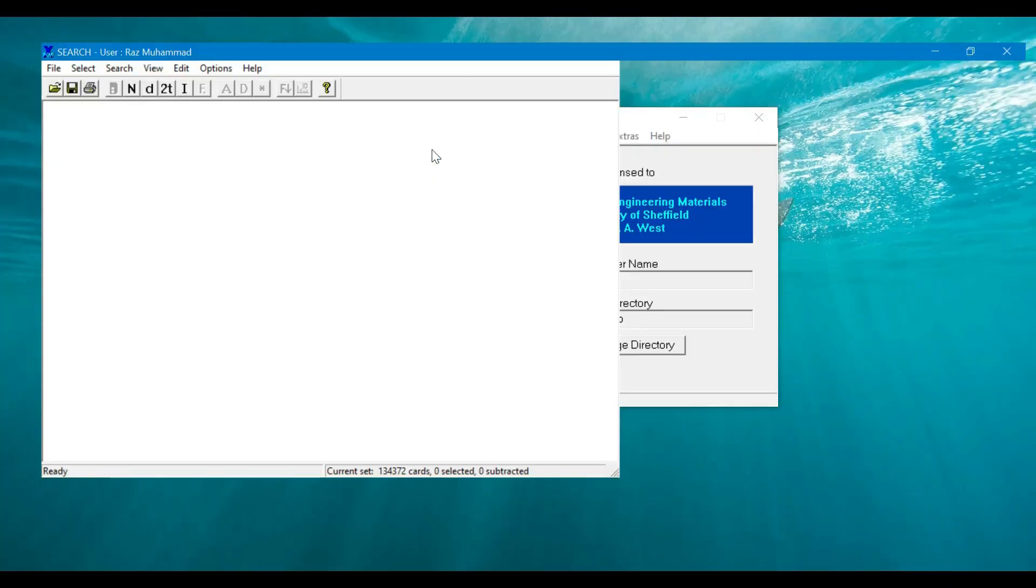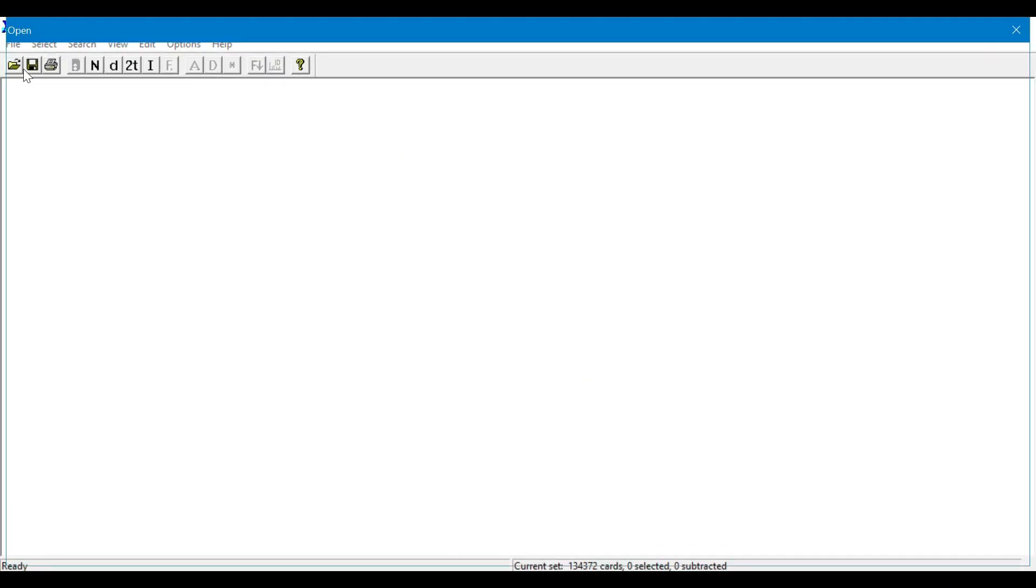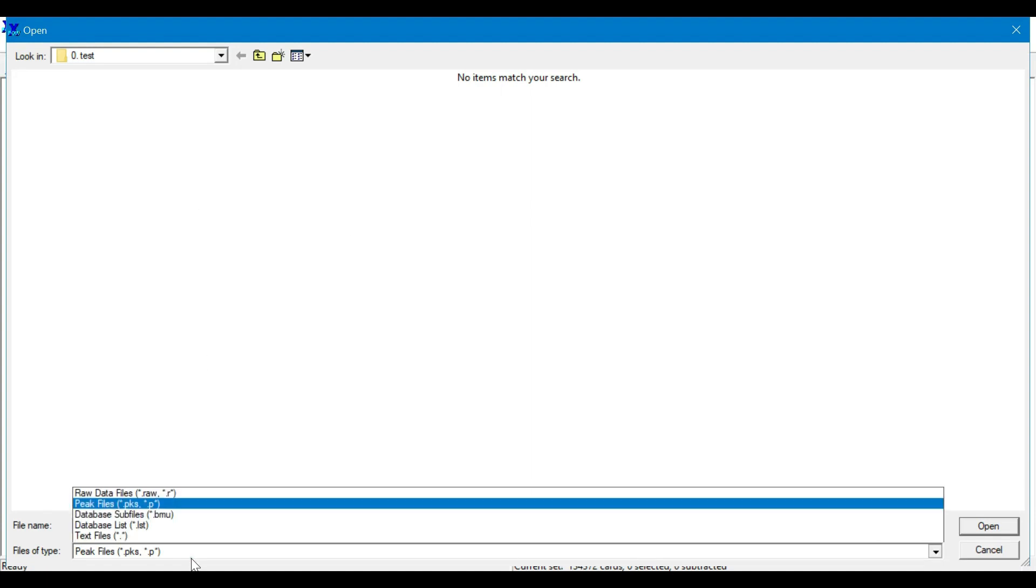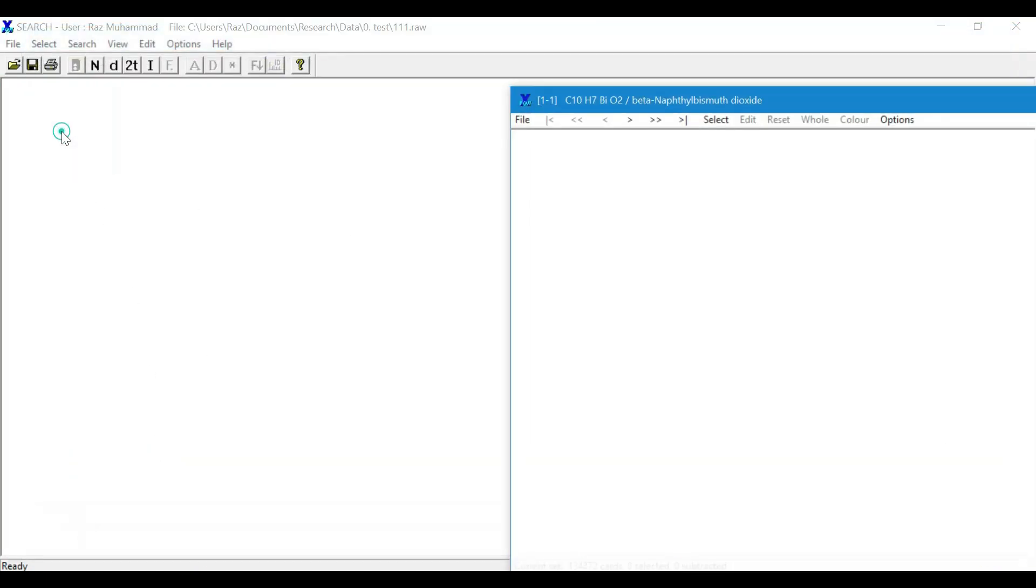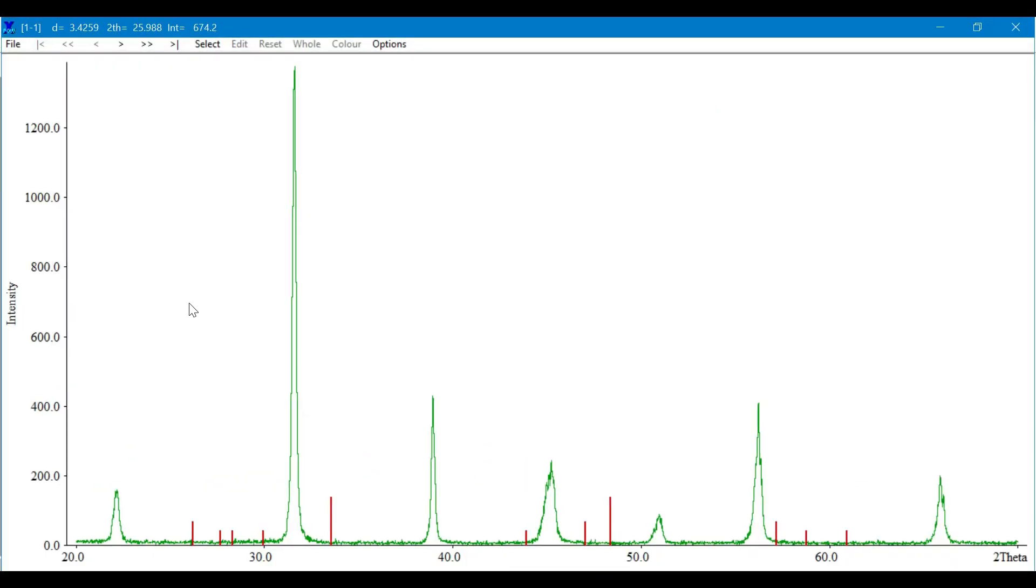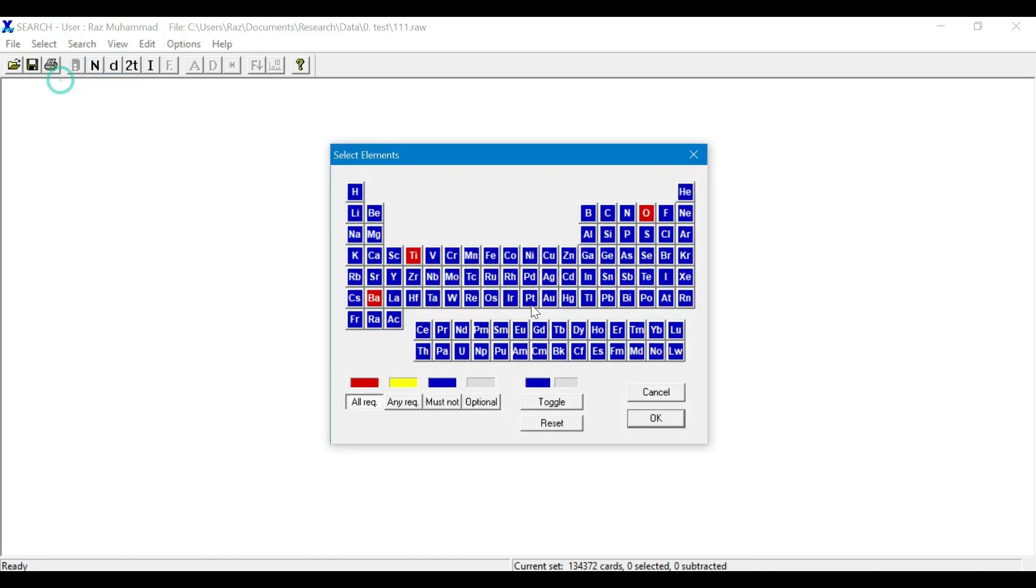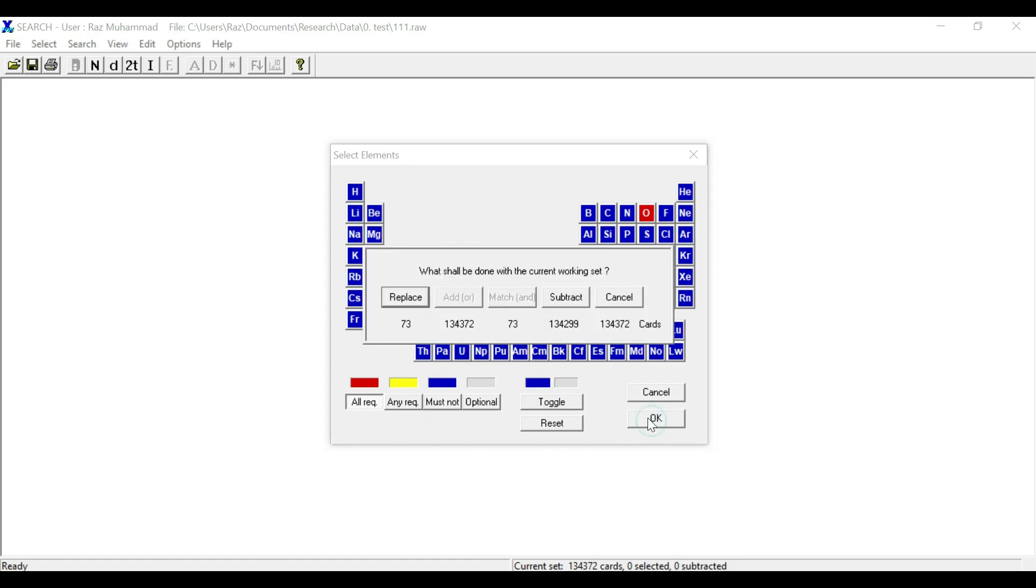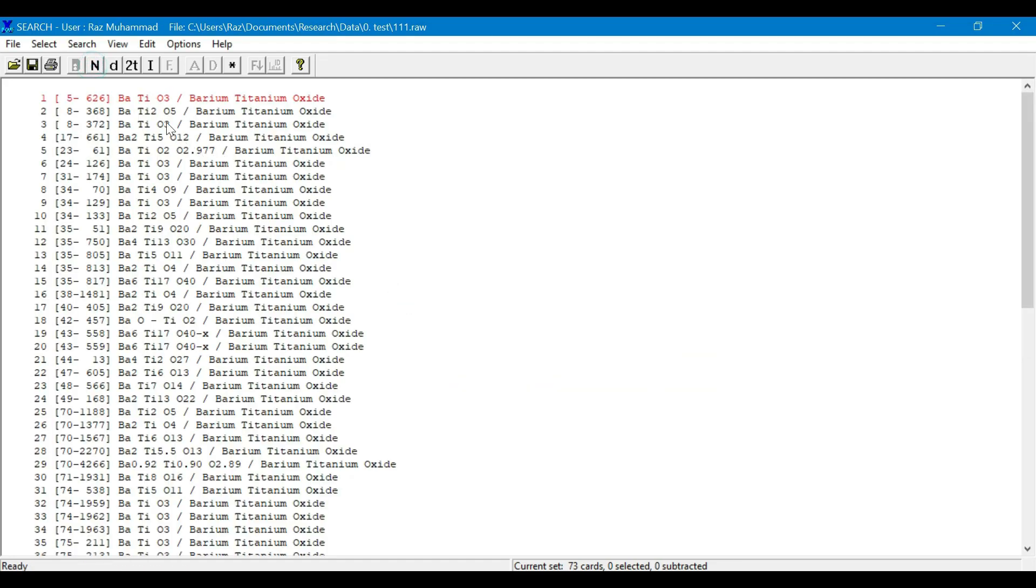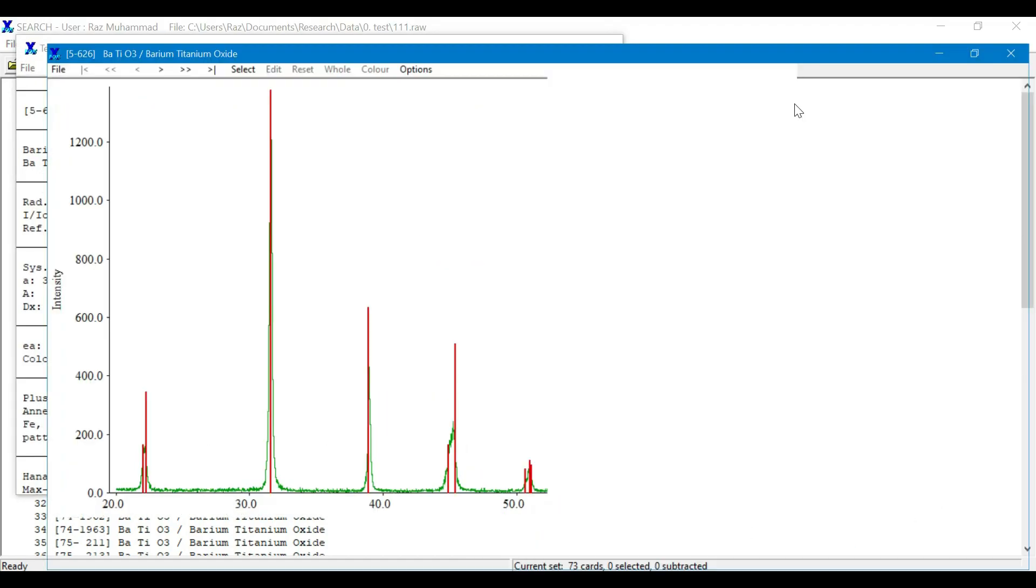Then go to select elements, and here you will choose different elements which are the constituents of your phase. Exclude other atoms, and here all the different combinations of these constituents will be listed, and you have to choose the correct one and compare with your XRD pattern.